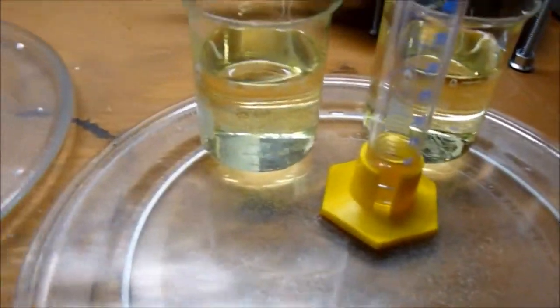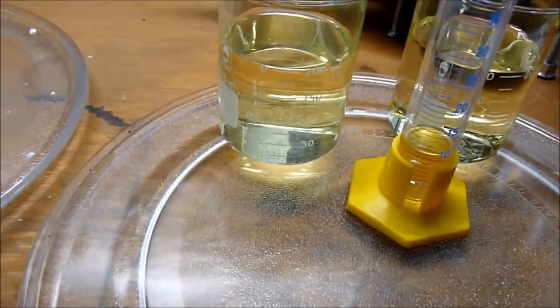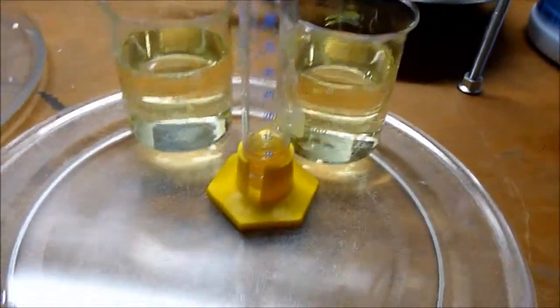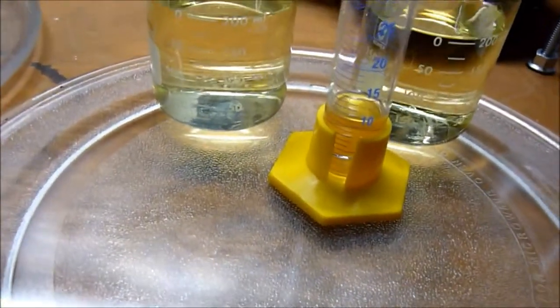Here are the reactants. We have 6.15% sodium hypochlorite solution, 400 milliliters of it in two beakers, and in the middle here we have just over 10 milliliters of acetone.